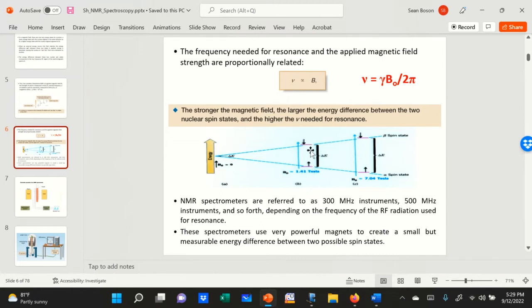Therefore, it requires a very tiny amount of energy, and that's why radio frequency radiation has just that amount of energy. Any other radiation is going to have too much energy that will do nothing because it is quantized, mechanically fixed, and cannot resonate with a different energy.